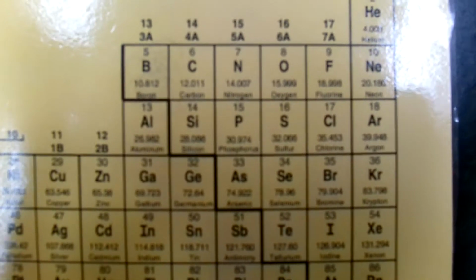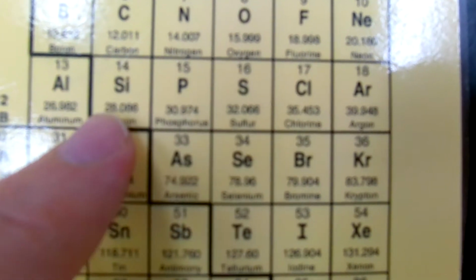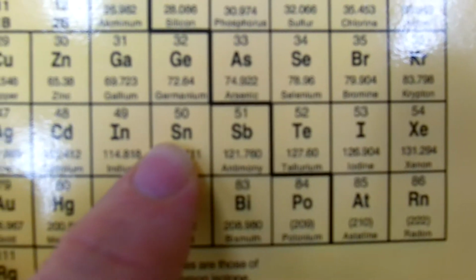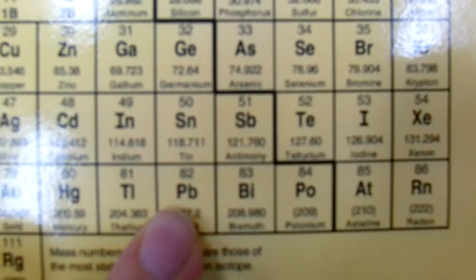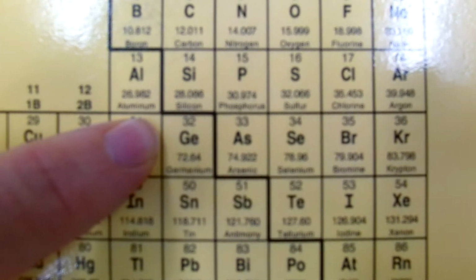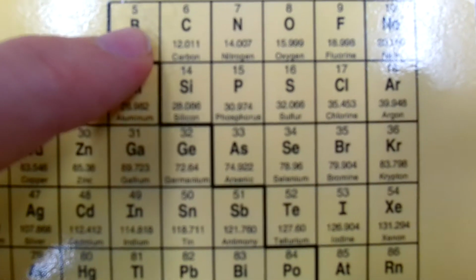To give you a little bit more of reference, we are looking at carbon right here, and we are looking at silicon, which we just measured, and we are looking at tin, which we measured, and lead. So we are trying to predict the density of germanium and carbon, all in the same group.